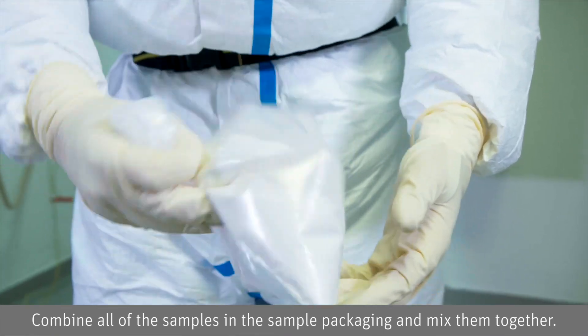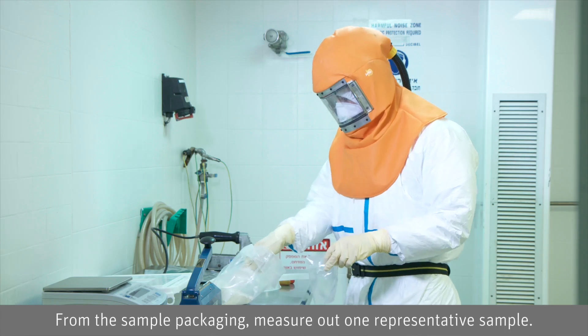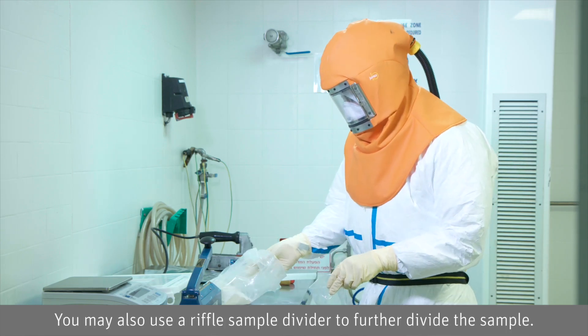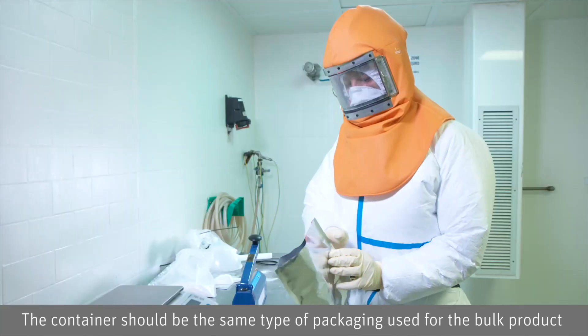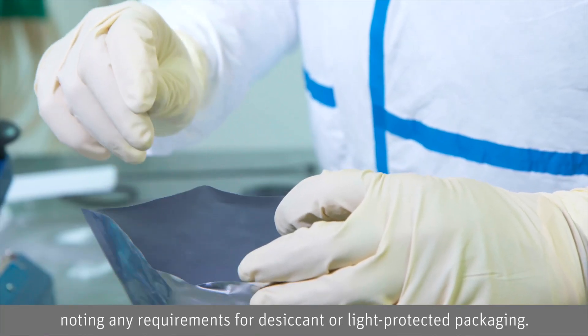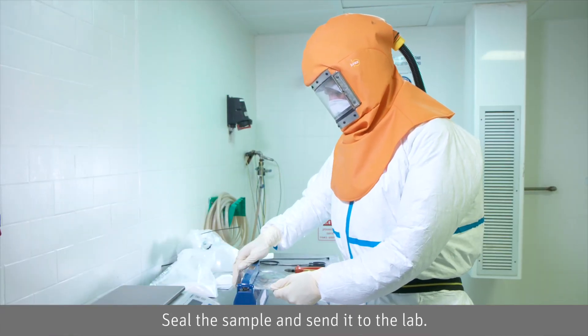Combine all of the samples in the sample packaging and mix them together. From the sample packaging, measure out one representative sample. You may also use a riffle sample divider to further divide the sample. Place it in the container going to the lab. The container should be the same type of packaging used for the bulk product, noting any requirements for desiccant or light-protected packaging. Seal the sample and send it to the lab.